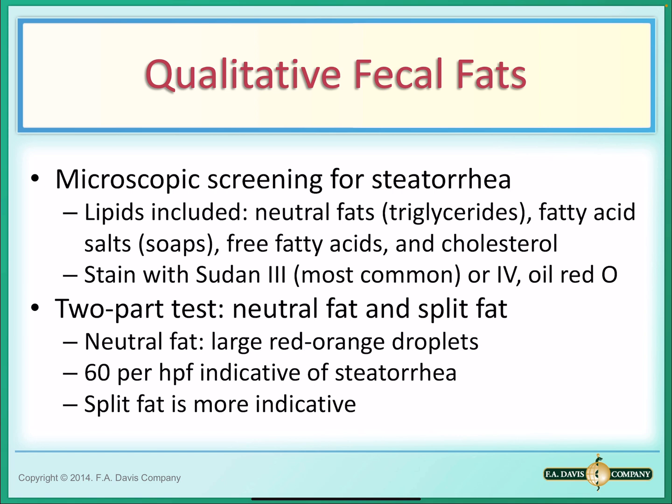The staining procedure consists of 2 different parts: the neutral fat stain and then the split fat stain. This is the 2-part test.